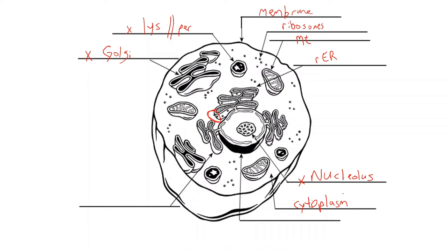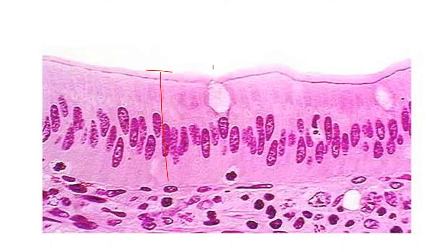The next arrow is pointing to the outer part of the nucleus. You could call that nucleus, or you could call that the nuclear envelope. I'm not sure exactly which one would be correct. In my opinion, both of those would be correct, because it is pointing indeed to the nucleus and the outer part of the nuclear envelope. The final thing is pointing to an extension of the nuclear envelope, but it doesn't have dots on it. It doesn't have ribosomes. No, it doesn't look like the coral that we drew in our lectures, but this would be the smooth ER, which has a different function depending on whatever tissue you're in, but primarily it's for lipid synthesis.